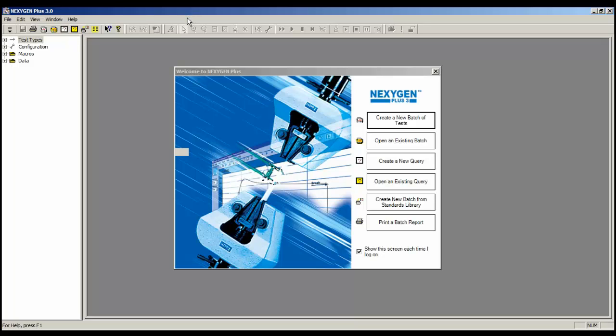Hello, I'm Chris, and today I'm going to show the Nexygen Plus statistical features. These are normally used to calculate the statistics for all data in a batch file, but a filter can be used to obtain statistics for selected tests.